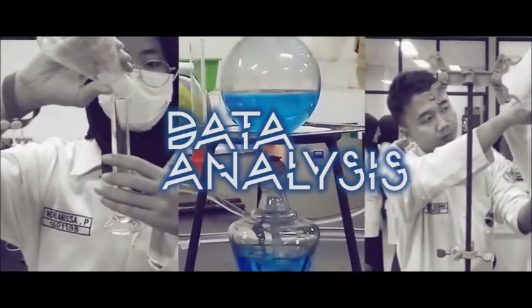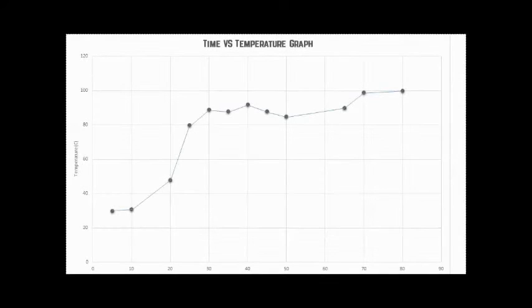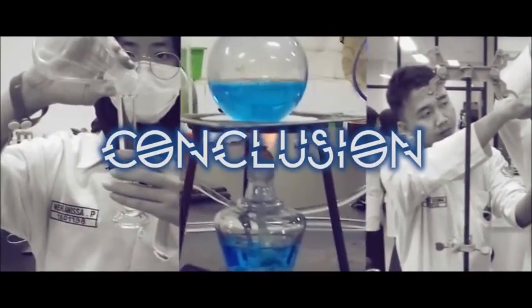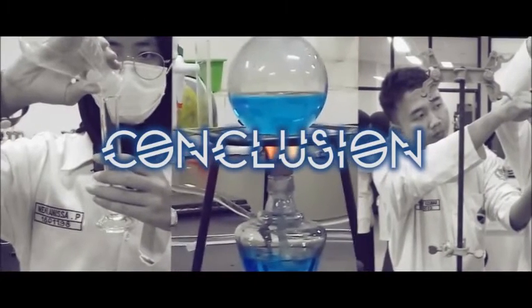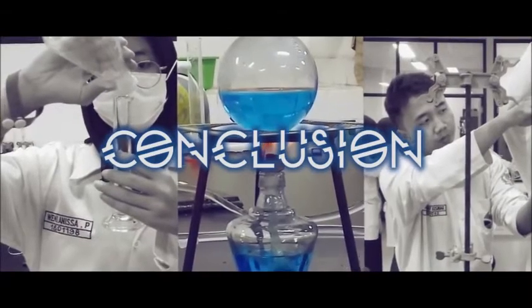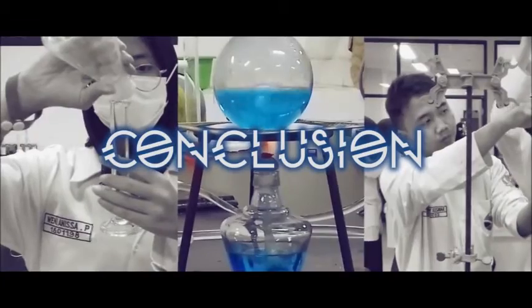After collecting the data from the experiment, we can make a time versus temperature graph. As you can see, the temperature graph is slowly increasing and decreasing until it reaches the constant temperature. After conducting the experiment, we can conclude that the distillation process can be used to separate copper 2 sulfate and water from copper 2 sulfate solution. The total volume of the distilled water is 13 milliliters.